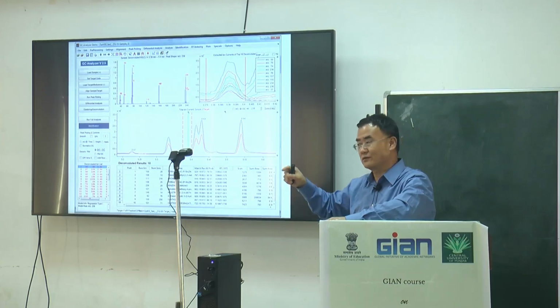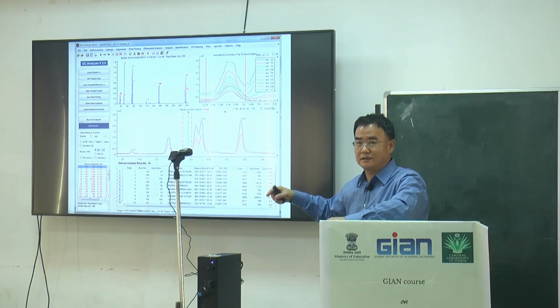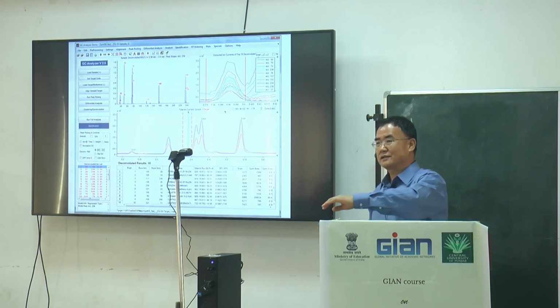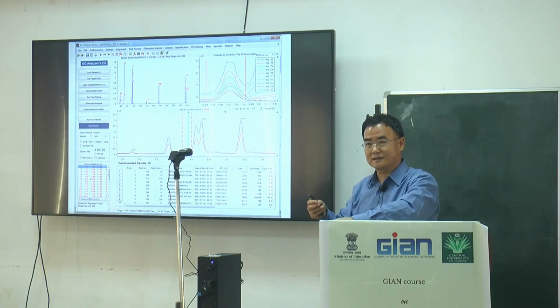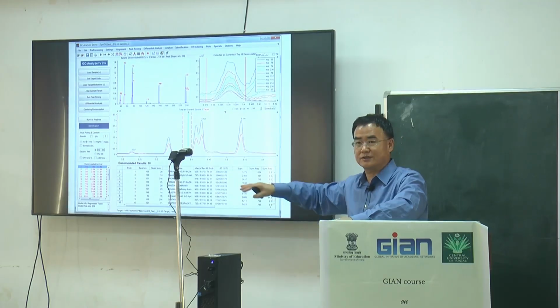The most important thing is what chemical property the stationary phase has, because the gas carrying your sample substances through also has a selection. They also can bind to the stationary phase, which retards them from continuing on.